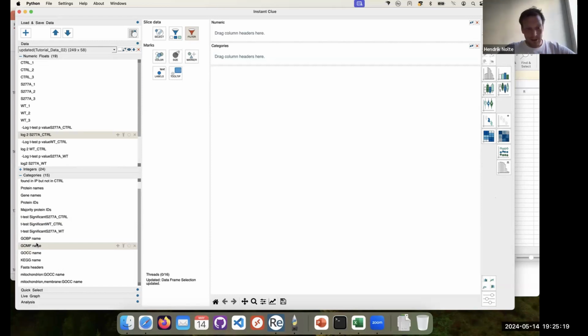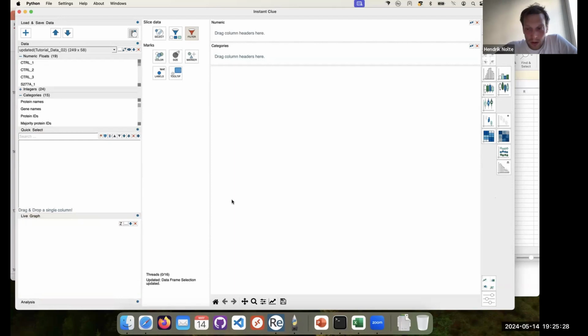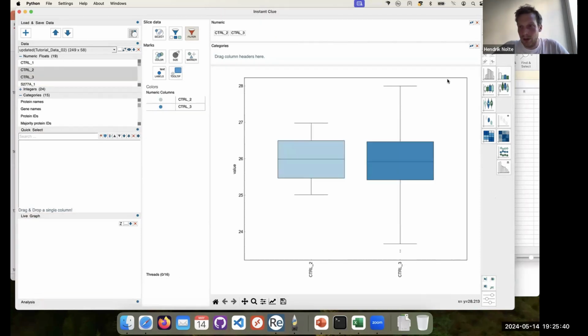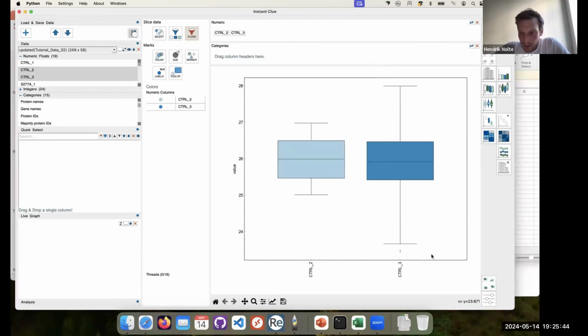Okay. Then I think we don't have time for a break, so I will just continue. I think we have covered most of the things. One very important point that always comes is actually how to alter the font size and the ticks and so on. So maybe let's just plot one simple graph. So in the setting, I'm sorry, that was too fast.